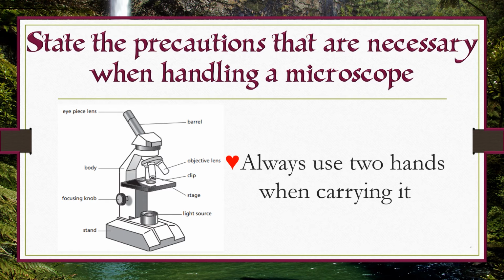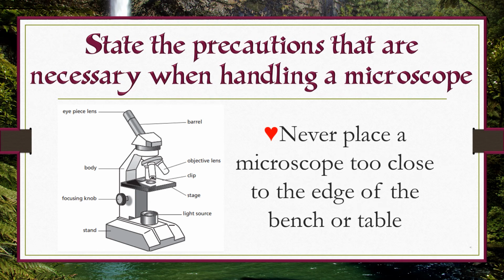Always use 2 hands when carrying it. Never place a microscope too close to the edge of the bench or table.